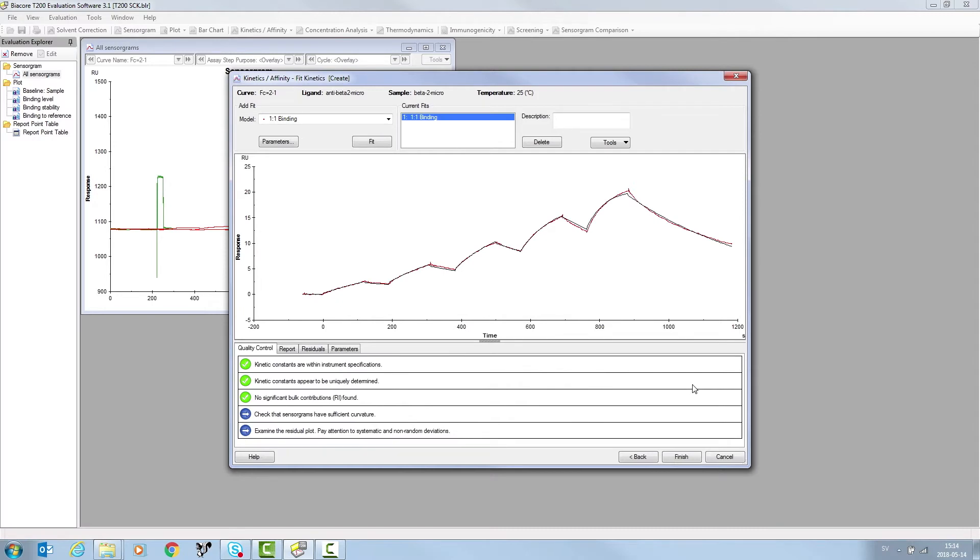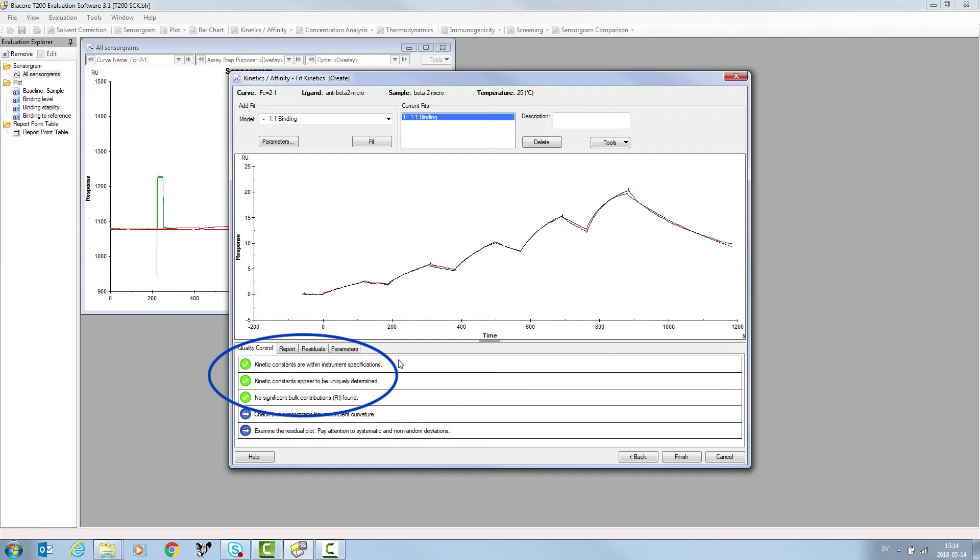In the Quality Control tab, a number of specifications are reported. In this case, kinetic constants are within the instrument specifications, they appear to be uniquely determined, and no significant bulk contributions are found.